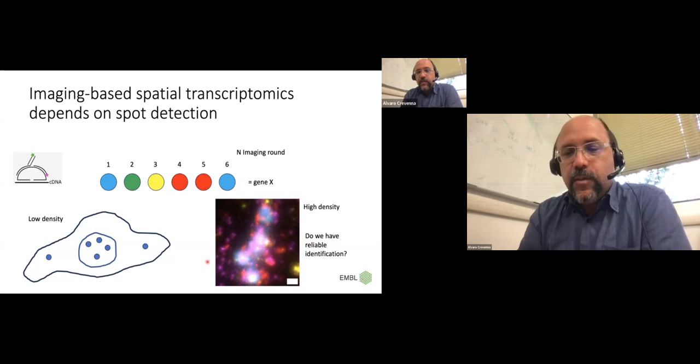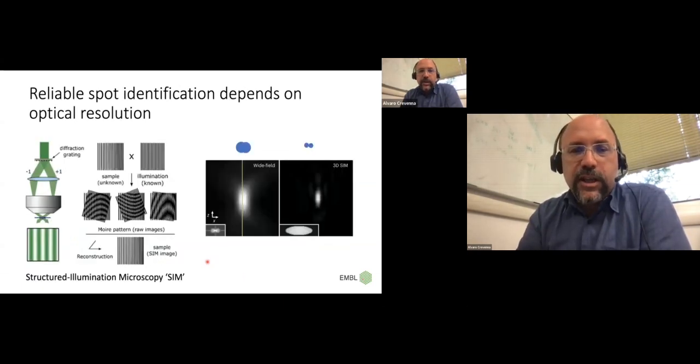There is: we can use structured illumination. In this case, we are imposing an illumination structure that we know onto a sample of unknown spatial frequencies. We vary the illumination structure that we know, and then we can reconstruct an image with a higher resolution or information content than what a single image had.